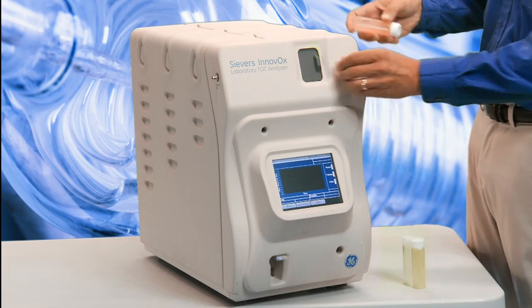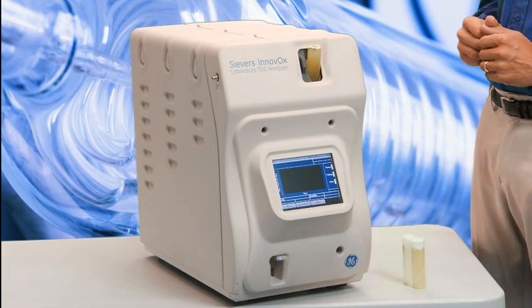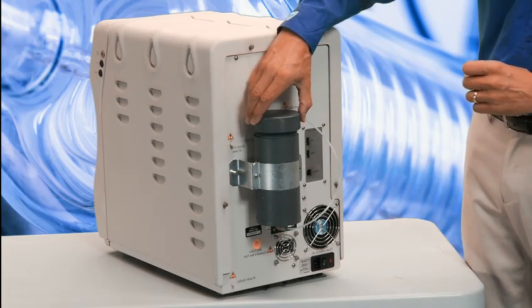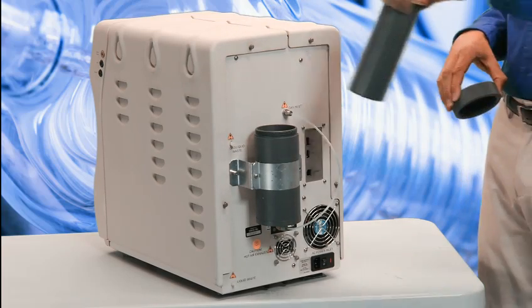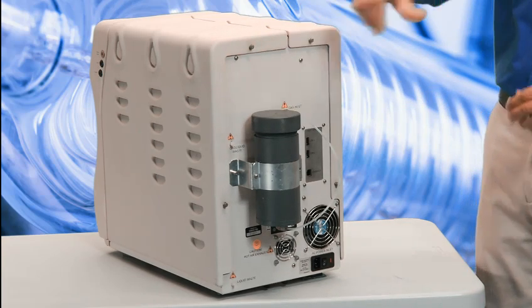First, the Innovox is simple to operate and maintain. It doesn't use any troublesome catalysts or replaceable combustion tubes, and it has a modular design for easy maintenance. It may be used with an optional onboard air filtration system, which eliminates the need for bottled gas.